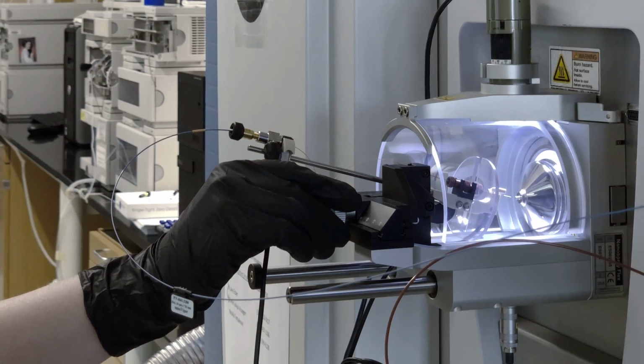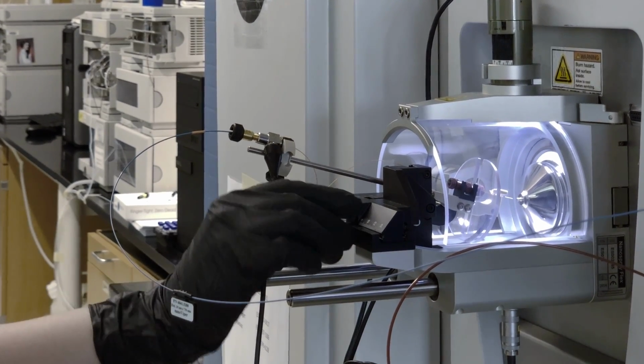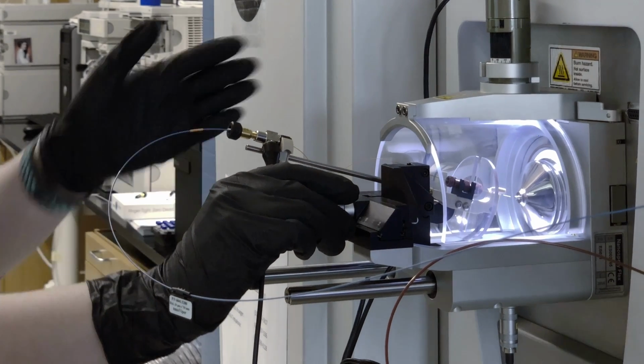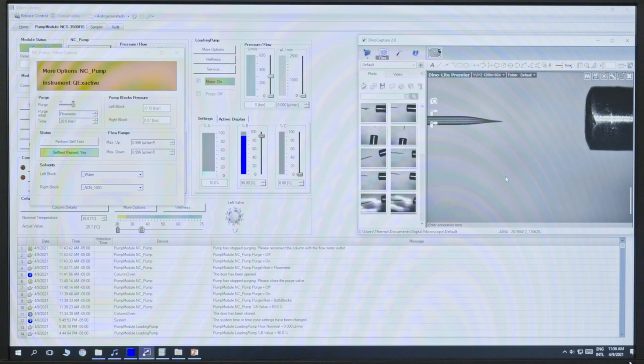And then you'll want to ensure that it's centered on the ion transfer tube. So here, this larger dial will move it sideways, which as you're looking at the screen will actually be top and bottom due to the position of the camera. So looking at the screen, I can see that the column is currently a bit too far to the left, which appears too high on the screen. So I'll adjust its sideways position until it is centered.